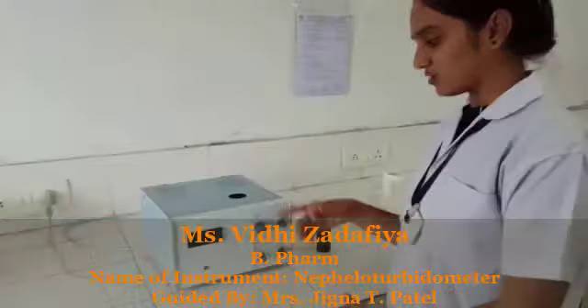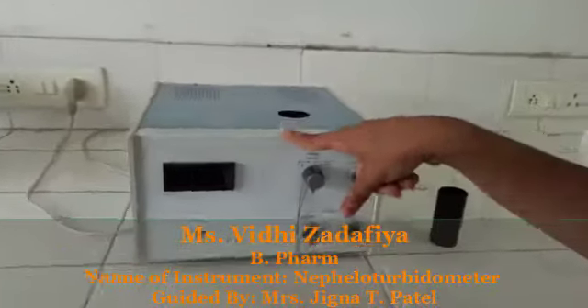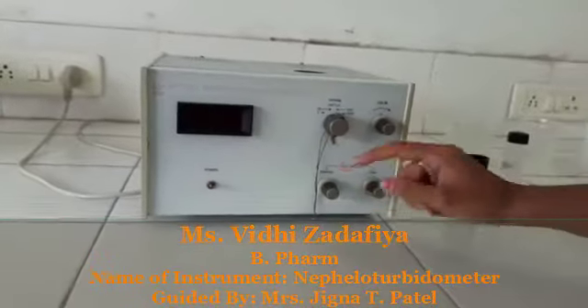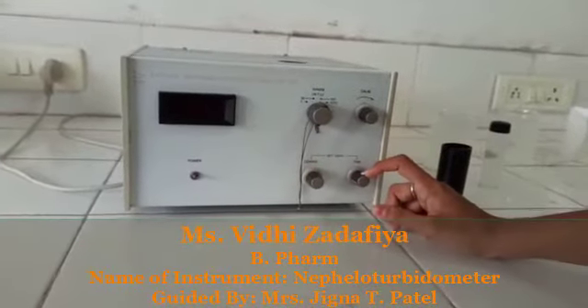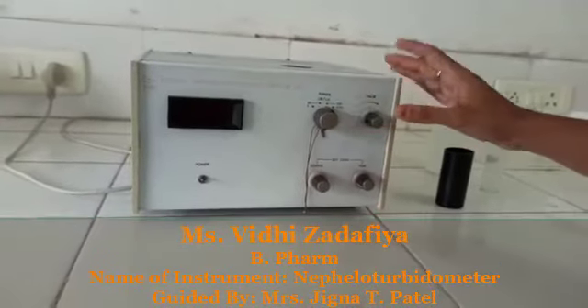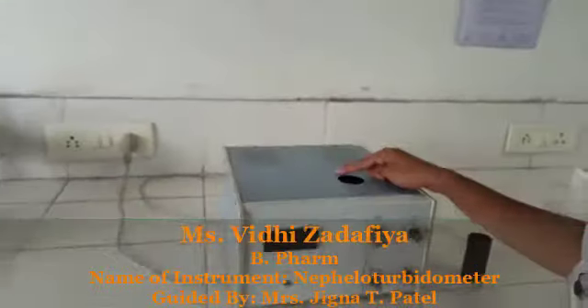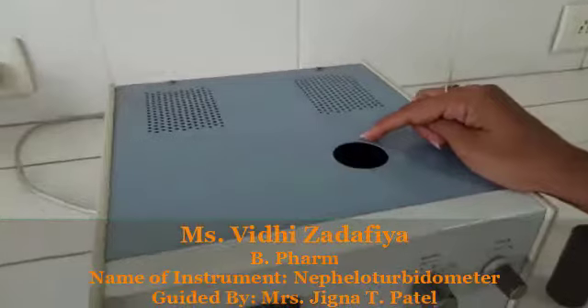This is our nepheloturbidometer and model number is 132, manufactured by Sistronic. This is our power button, coarse adjustment and fine adjustment for the set zero. This is range and calibration for the hundred setting knob.